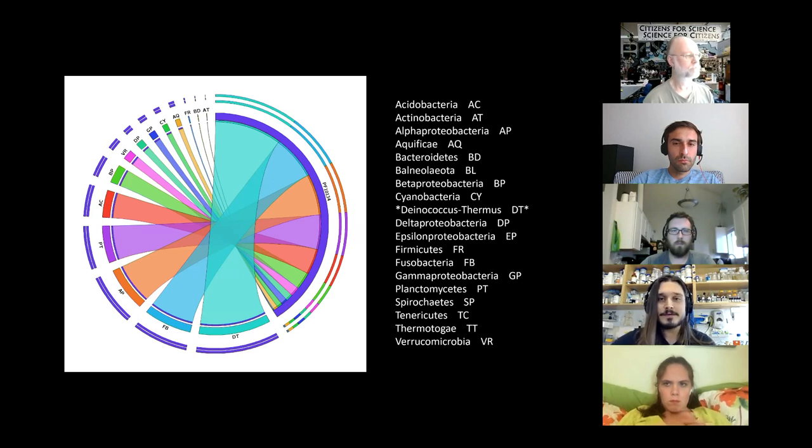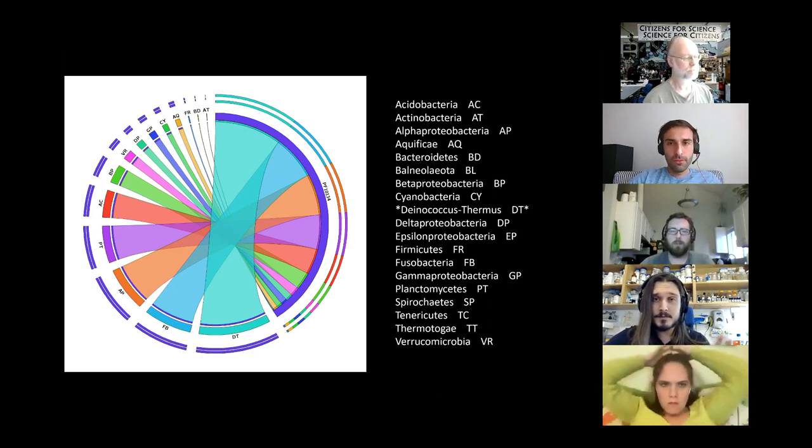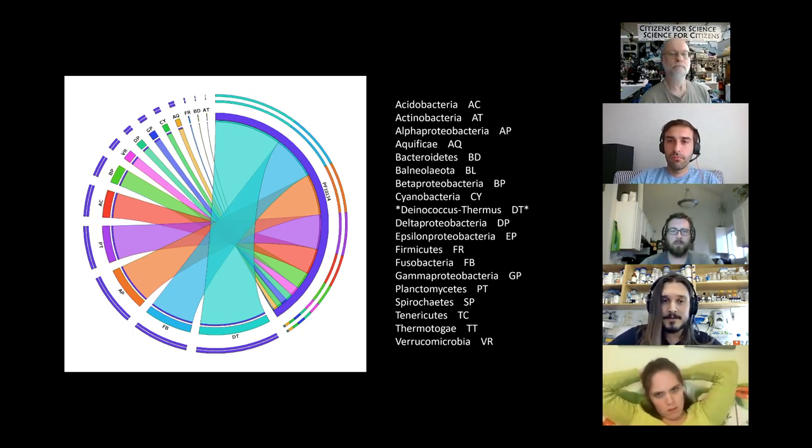And we've noticed that the particular replication protein is extremely present in DT, Deinococcus-Thermus. And there's a legend on the right side, but that teal color is the one we're most interested in. Right, so our protein is mostly there, but it's also distributed in many other places. You could see it touching many of the actual specific phyla.